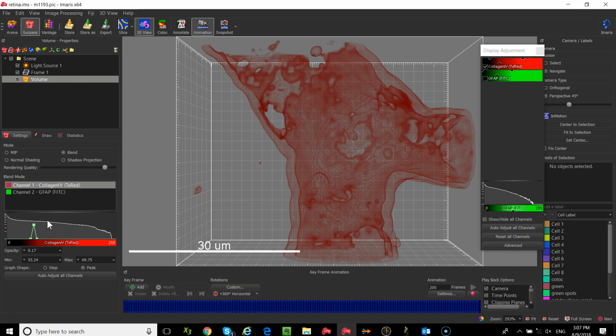So when you visualize data, remember I was saying when we were playing with the opacity in the step mode, the dimmer structures will become opaque before the brighter. So if you're trying to adjust the opacity, you lose your dimmer structures first. This technique allows you to specify a particular range that you're interested in, make them hollow so it's easier to see things inside. Okay? So, do you have a question? No? Oh, sorry. Okay.